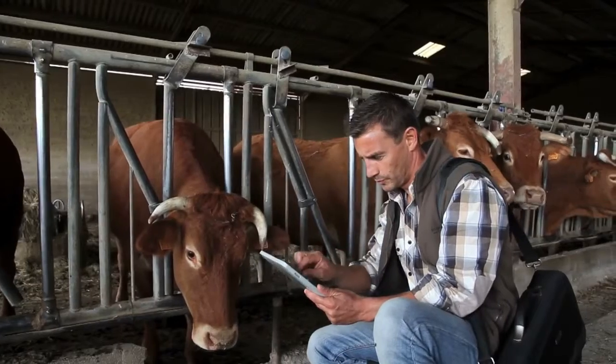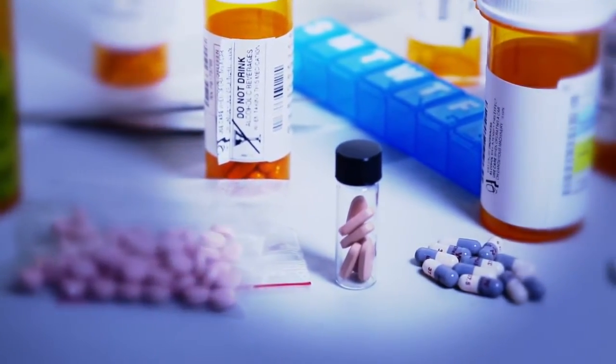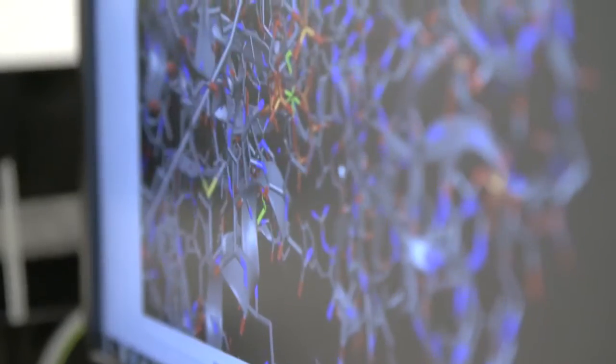People have used RPA to detect the plague, anthrax, testing for foot and mouth in cattle, testing for the MERS virus, screening for cancer drugs. People are also using RPA to look for GM crops. There's a number of people looking at using RPA to detect plant pathogens. It's also been used for a number of different food safety tests. So people looked at salmonella and listeria.